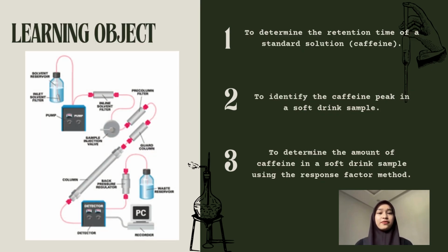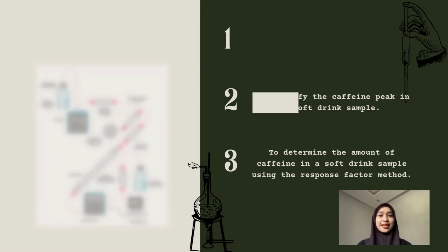For the objective, first, to determine the retention time of a standard solution, caffeine. Second, to identify the caffeine peak in the soft drink sample. And last, to determine the amount of caffeine in the soft drink sample using the response factor method.